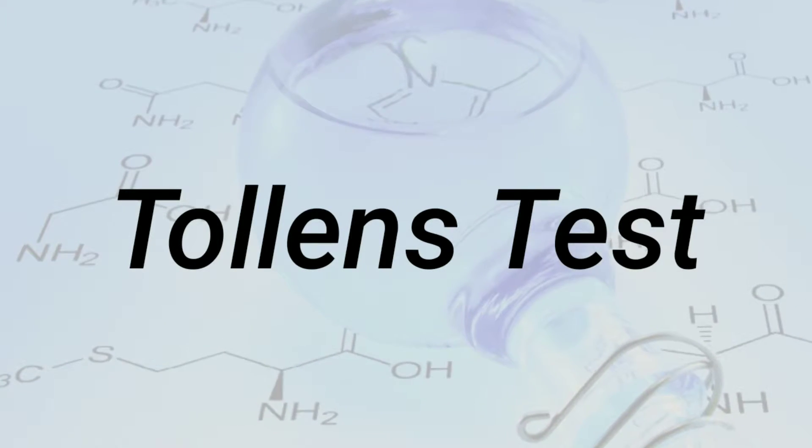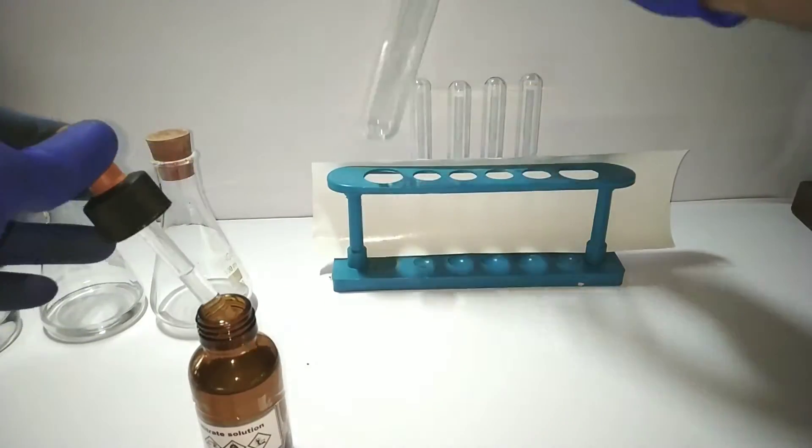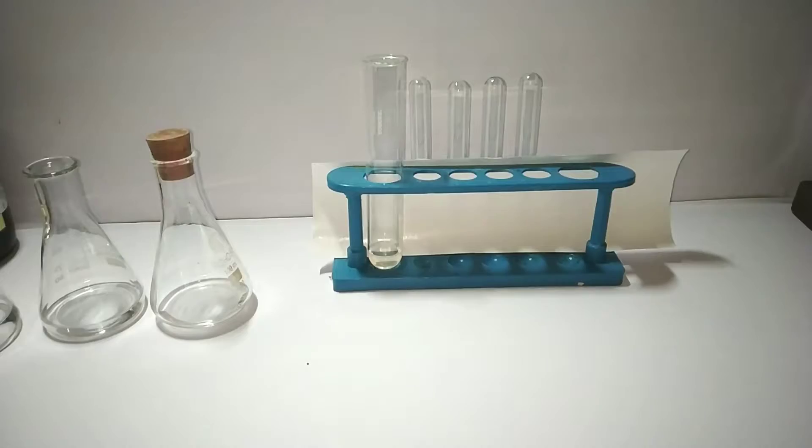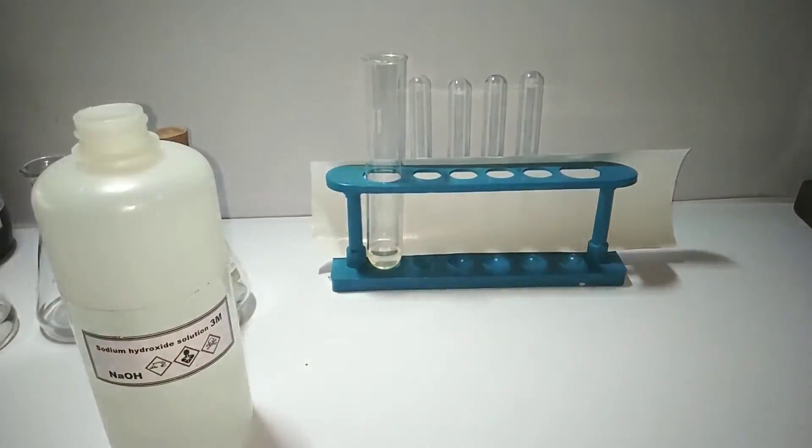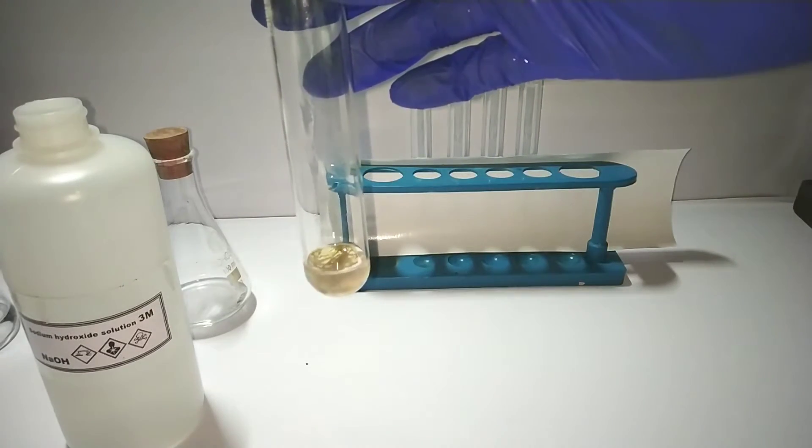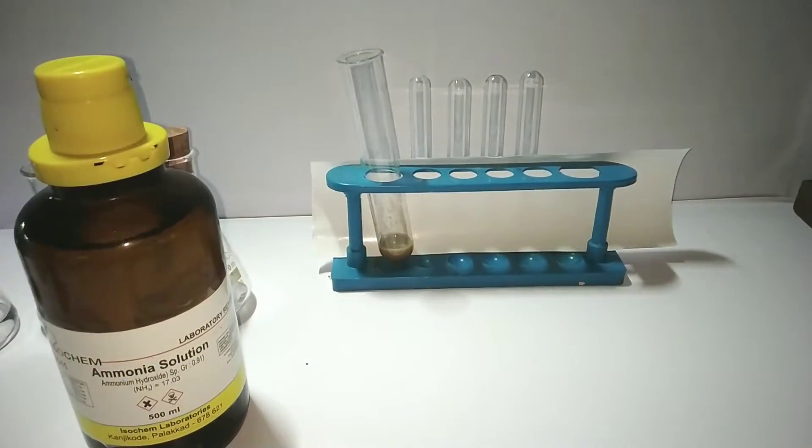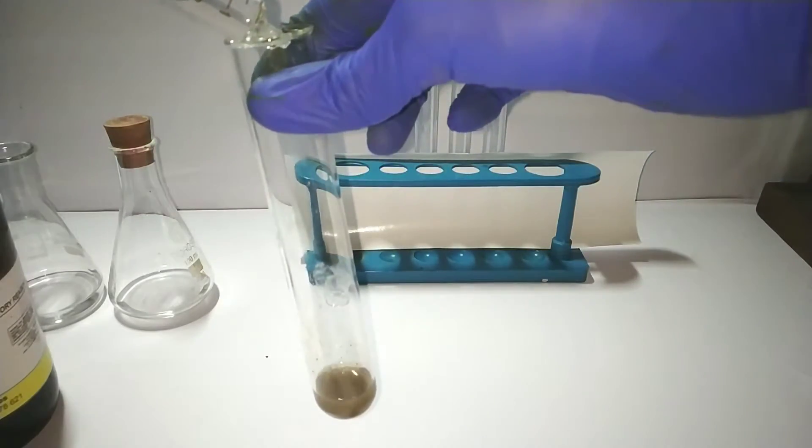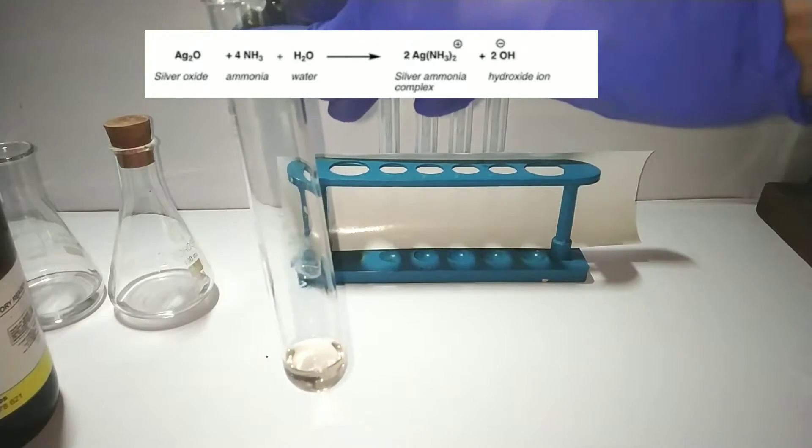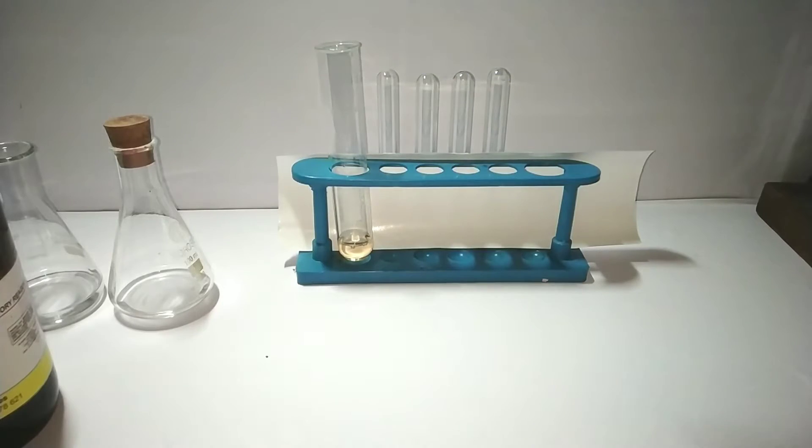Tollens test. This is a specific test for aldehyde. First of all, let us make the Tollens reagent. For that, we need a solution of silver nitrate. Take about 3 milliliters of silver nitrate solution which has a concentration of 0.1 normality in a test tube. Then we add 3 molar sodium hydroxide solution to the silver nitrate. On adding the sodium hydroxide, a black to brown colored precipitate of silver oxide is immediately formed in the test tube. Now we take the ammonia solution and start adding it to the precipitate of silver oxide. You see that the precipitate starts to dissolve and the solution becomes clear. What's happening here is silver oxide is forming a complex with ammonia. This is the Tollens reagent. Tollens reagent have to be prepared freshly each time for use as it is not stable for long time storage.